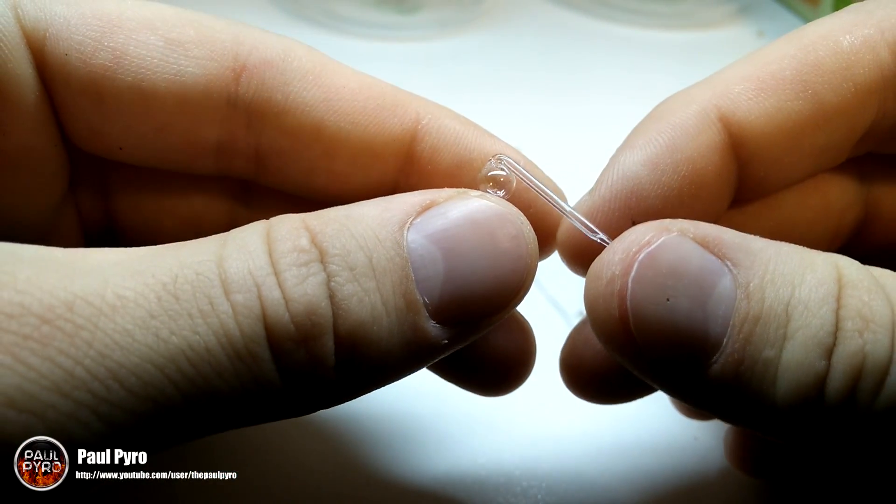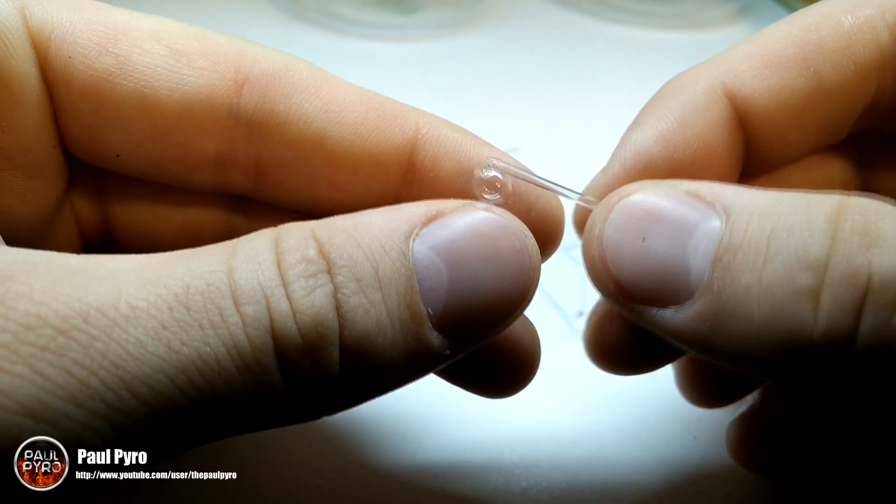Hey everyone, it's Paul Pyro, and today I want to show you the world's smallest glass distillation unit. What makes it special is it's some of the smallest glassware I've ever held. I'm going to show you how I made it and some tips and tricks so maybe you can make your own. Alright, let's get started.